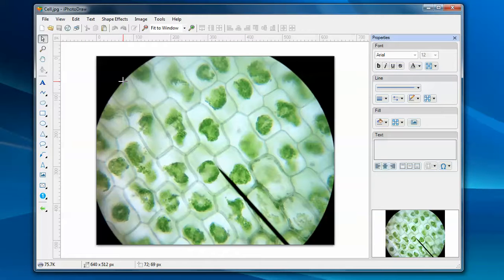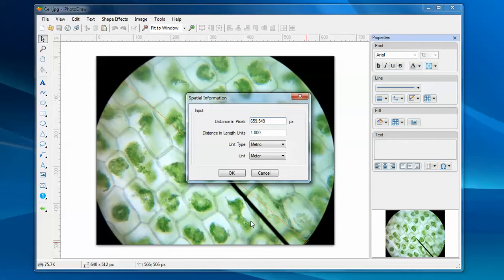I click the mouse on the image for the first point, drag a line, and click the mouse for the second point. This dialog tells you the distance between these two points measured in pixels, and what you need to do is to tell the system the distance between these two points measured in spatial units.